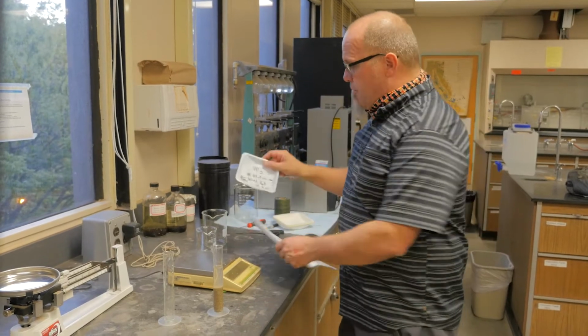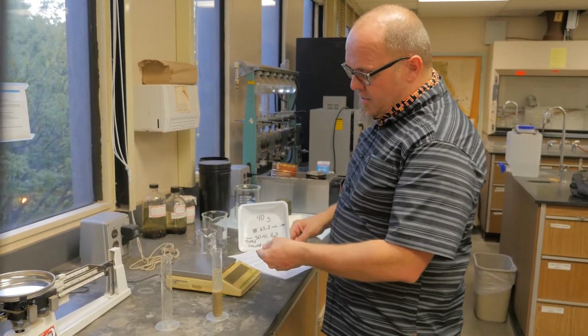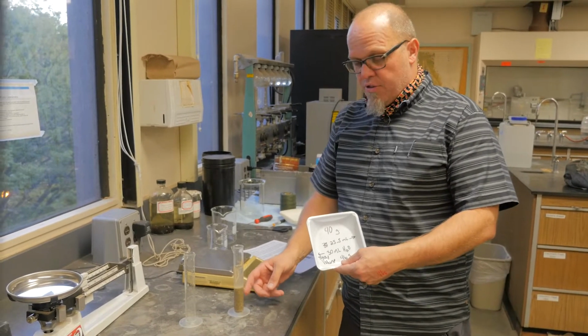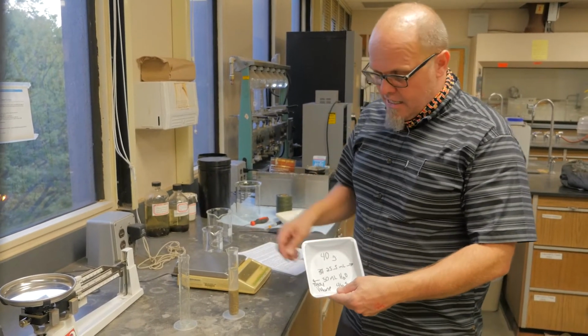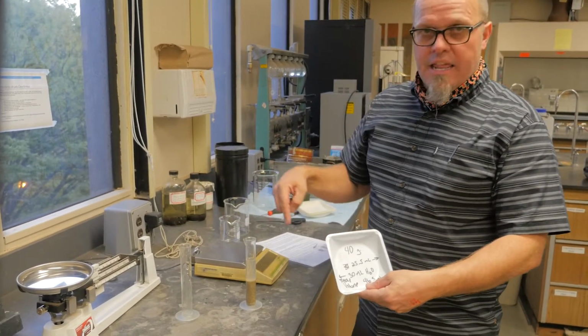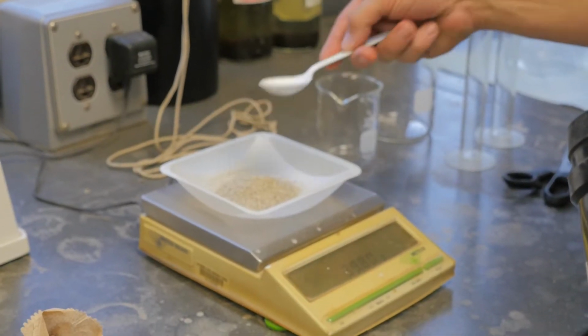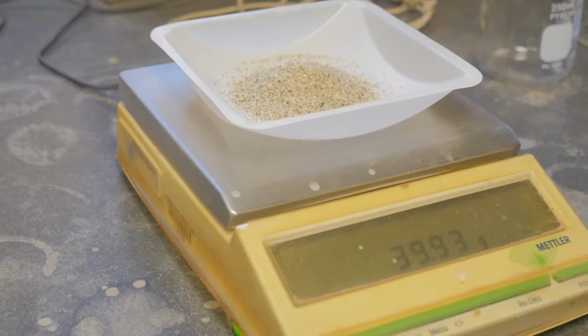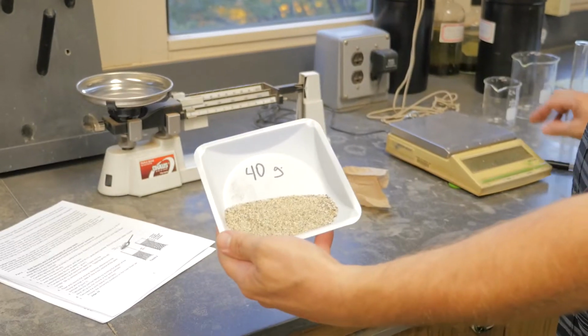We're weighing out a sample of 40 grams. We put the sand in and measured the volume that the sand took up when we packed it. We weighed out 30 milliliters of water and poured it in. Like I said, we had 40 grams of sand that we weighed out in this boat. We weighed it on the electric scale, and then we tested the triple beam balance.